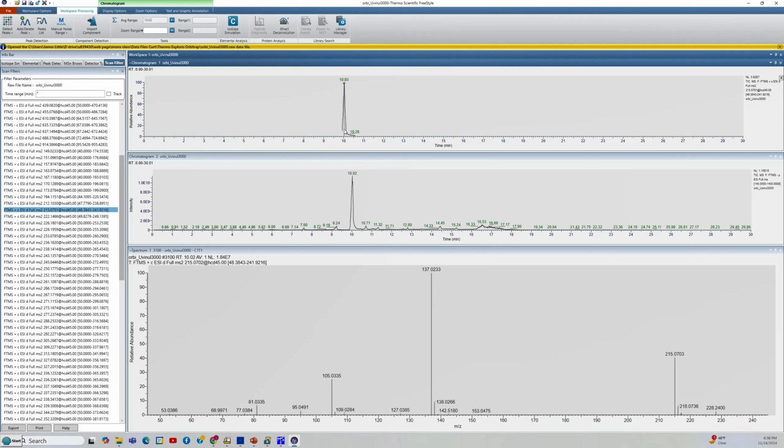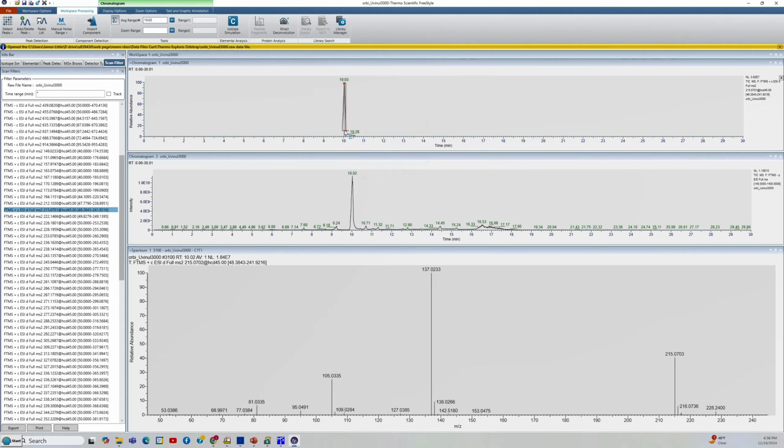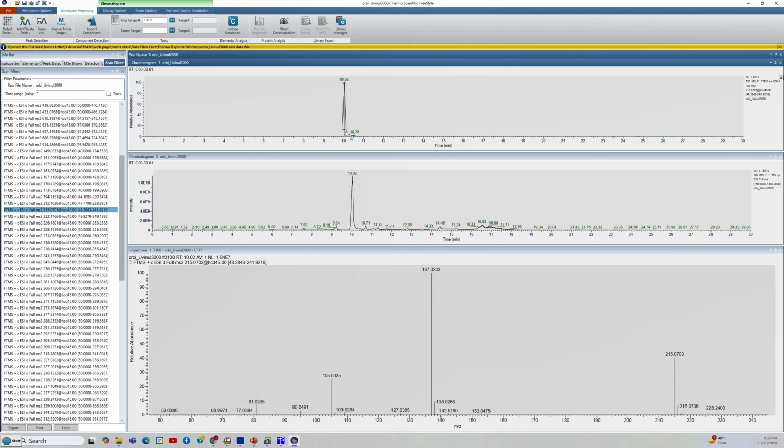But if we click on that, again, you'll see a nice MSMS spectrum for the M plus H that you can send to the NIST search. And again, you could average it if you're doing elemental composition to maybe get better accuracy or precision for the measurement if you were sending it within the Freestyle program. But if you want to send it out to the NIST search, you can only take one click to get one scan and then send that to the MSMS.